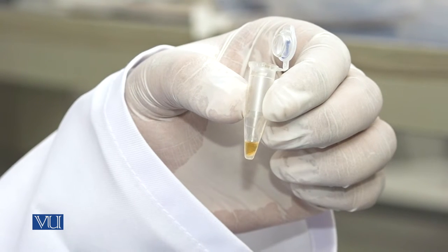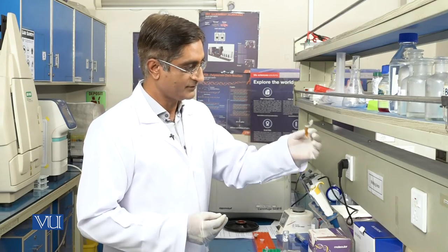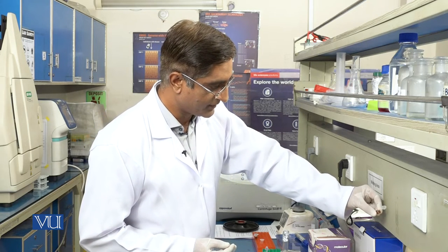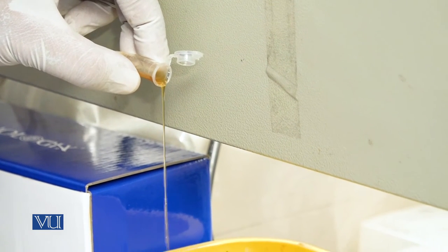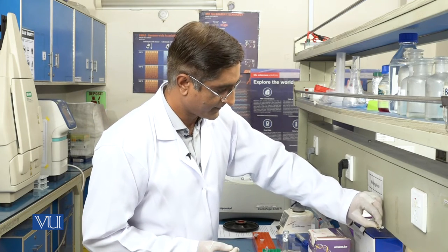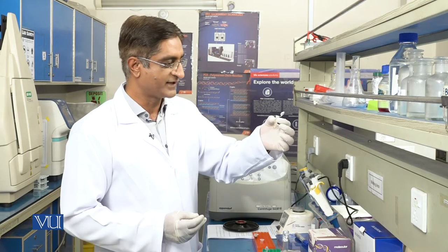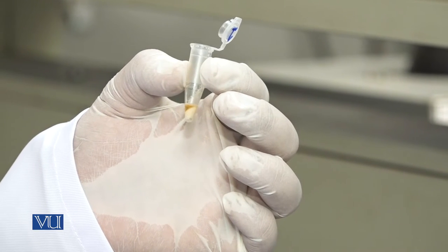Here is the pellet. Now I will discard the supernatant from the other tube as well. I am using 2 tubes to maintain balance in the centrifuge machine. In this tube you can see the pellet is more clear — these are the bacterial cells from which we are going to extract our plasmid DNA. Now our bacterial cell culture is ready for further use, so we will proceed to our plasmid extraction kit.